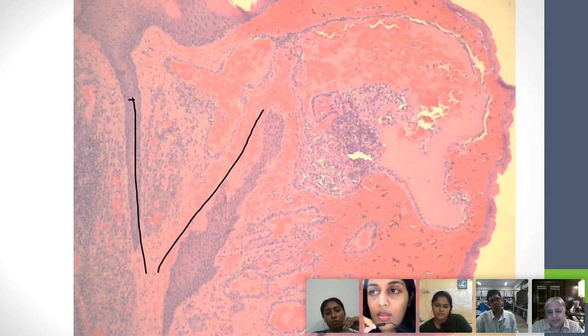Now, if this is keratin, what do you think this is? And what keratin forms as the outermost layer, how many layers should there be below it, deep to it? 4 layers at least. I mean, no, keratin is formed from the corneal layer, so 3 more layers below.